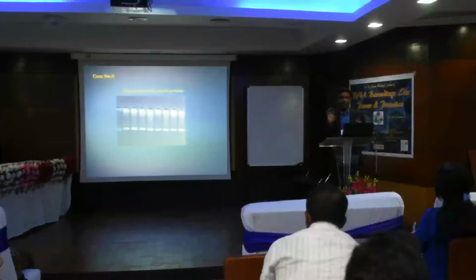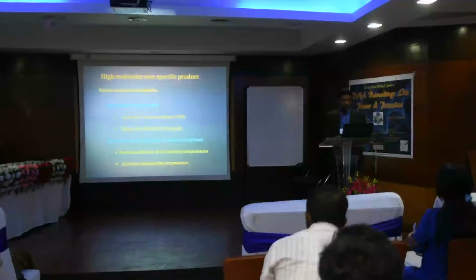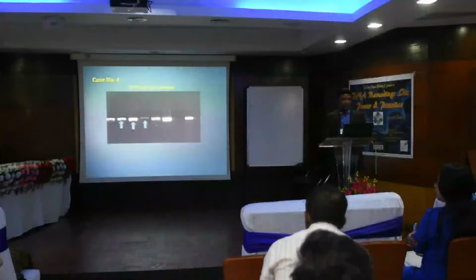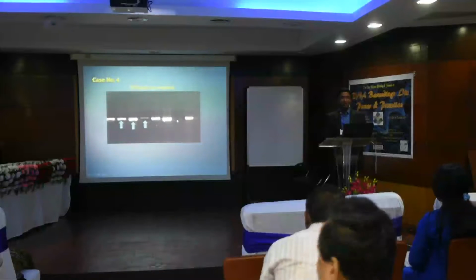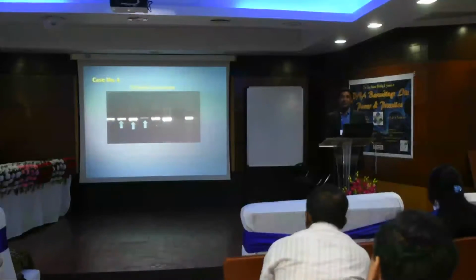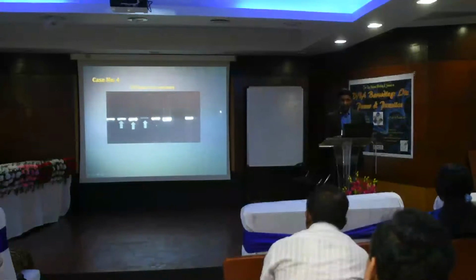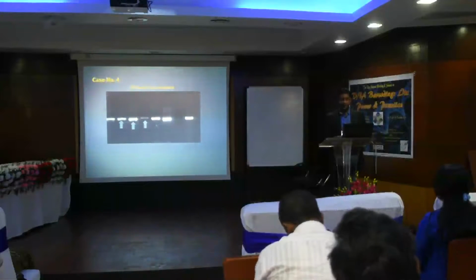Some template will remain as it is and will glow on the gel. Then sometimes students feel very happy if they are having this thick band. Looking at a thick band, students always get tempted, but these thick bands always create problems in your sequencing reaction. In these cases, usually if you are having such patterns, not uniform ones, that means your pipetting is definitely not good.